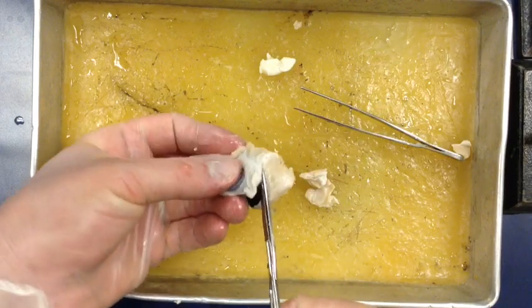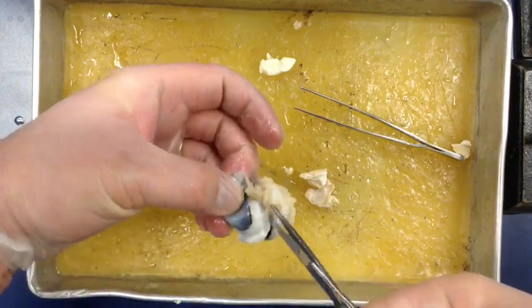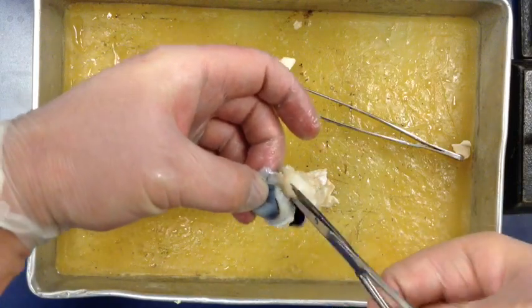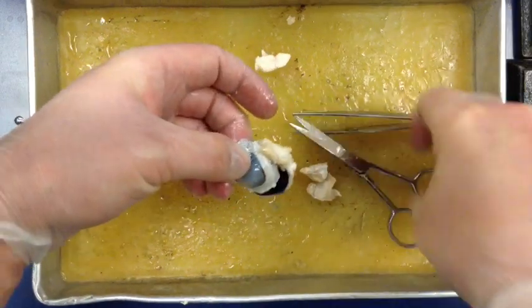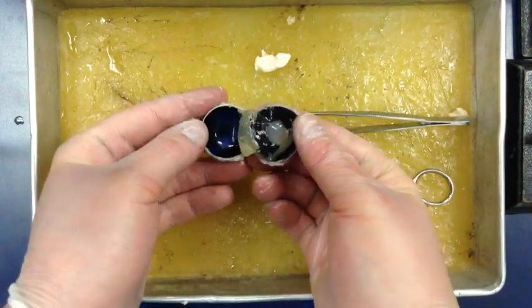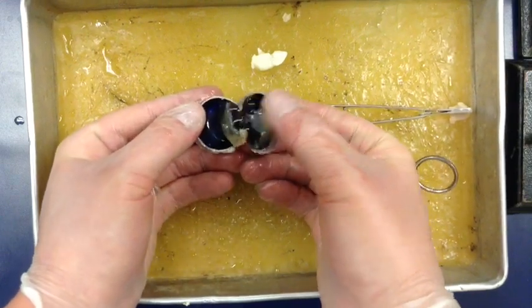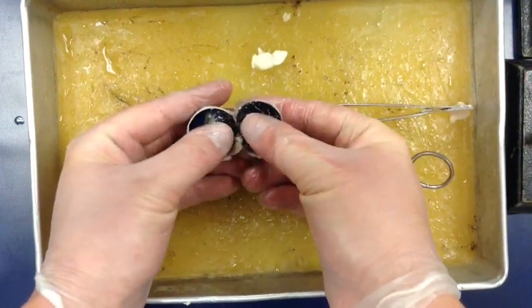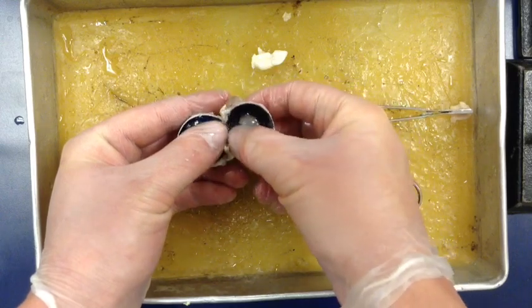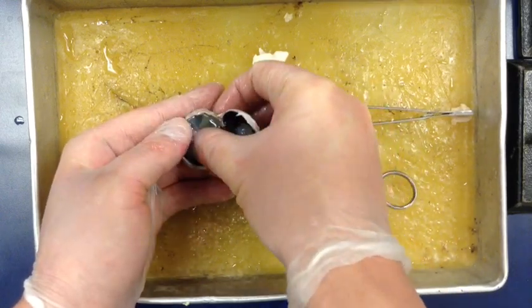As we start to cut this open, you might notice it's quite dark inside. Here's the inside of the eye. The first thing I notice right away is the gooey part - that's the vitreous humor. That's the part that actually maintains the shape of the eye. We don't actually need that, so we're going to wipe that off.